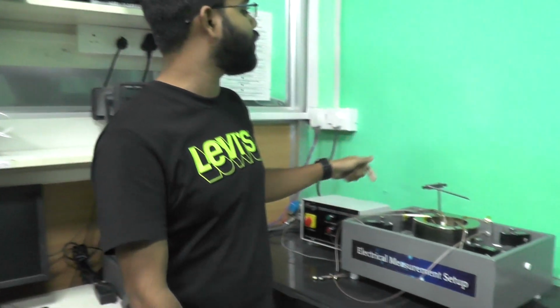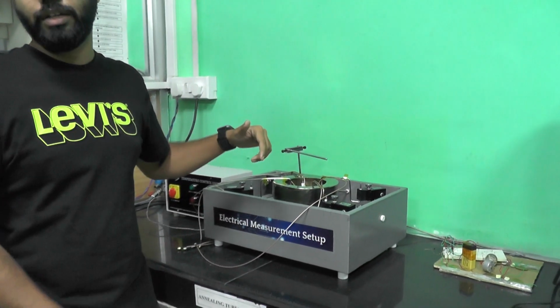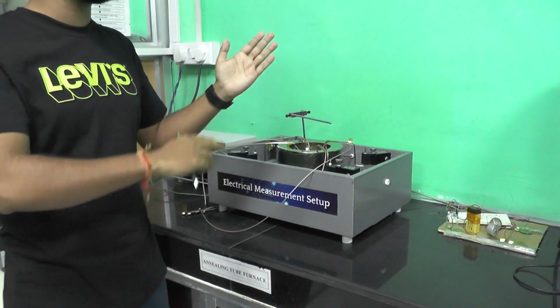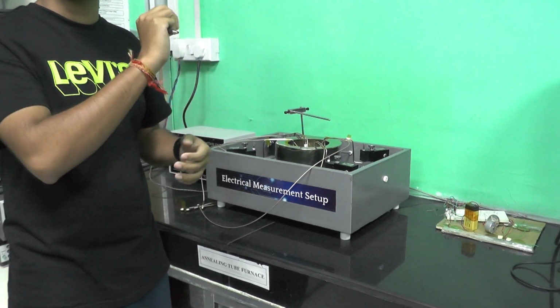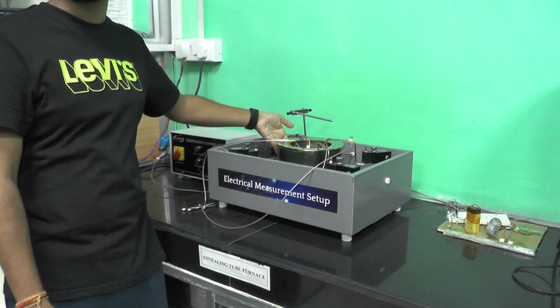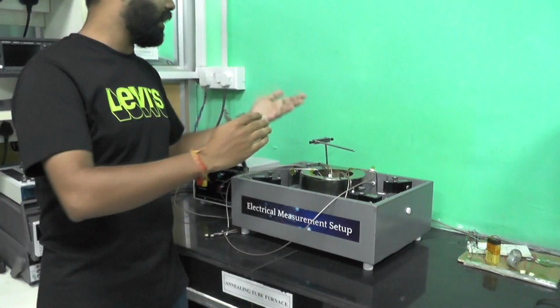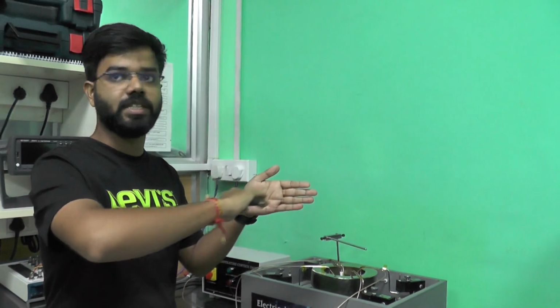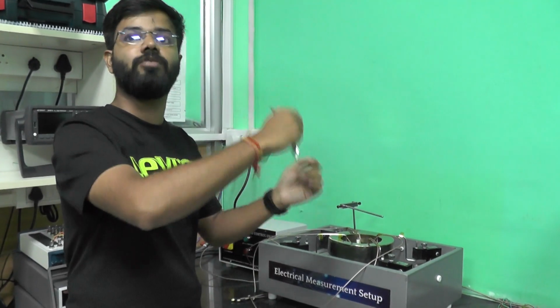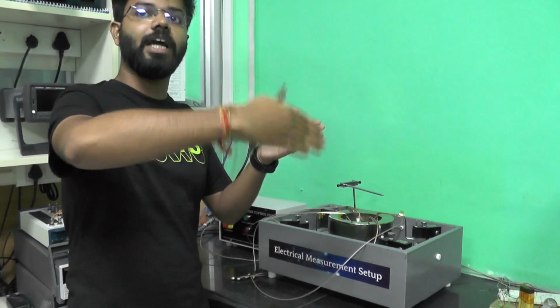In this case, we are also varying the temperature. We are getting a constant measurement, like 2 or 3 measurements per minute. Using this temperature control unit, we are giving temperature to this setup, and as time goes, the temperature gets increased, and we are measuring each and every iteration.